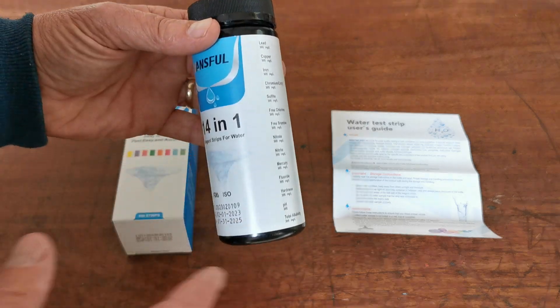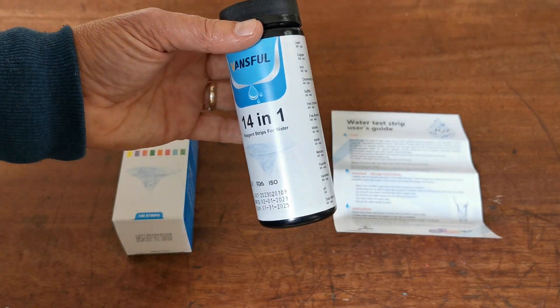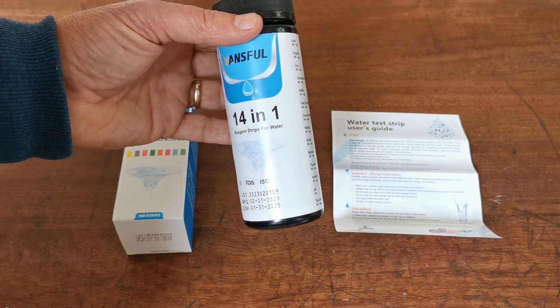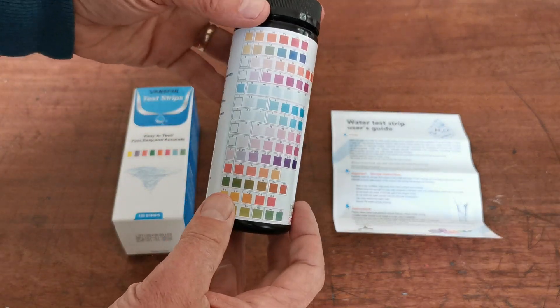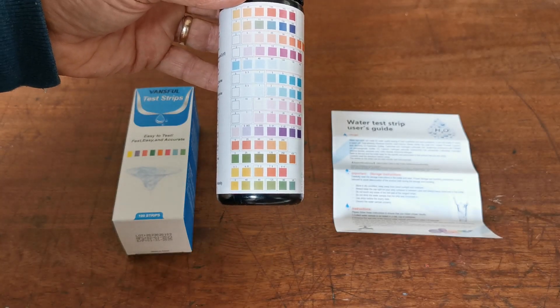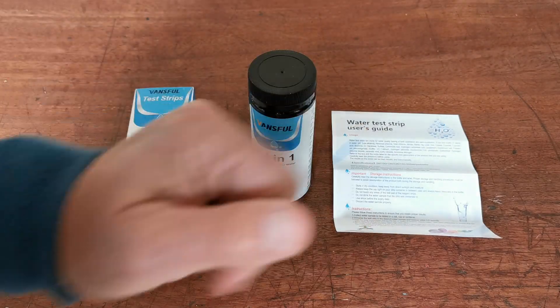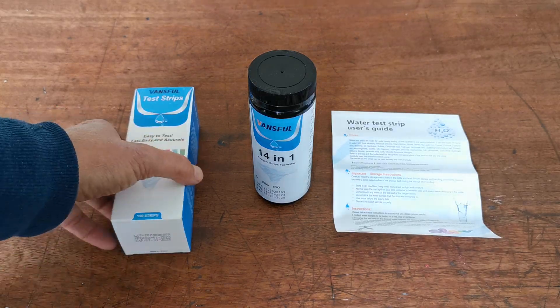It's a nice easy dip test. The technique is to have a container at least as deep as the length of the test strip, put your water sample in, dip the strip for two to three seconds, remove it and tap it dry immediately to avoid any bleaching or running of color from one pad onto the next. Then read it at the specified read time.